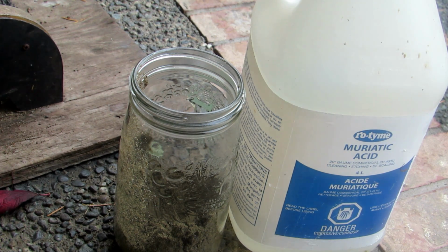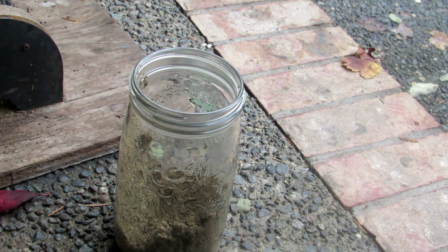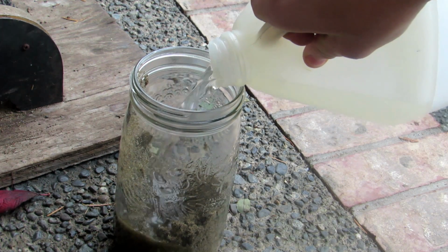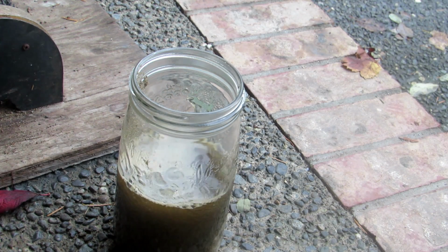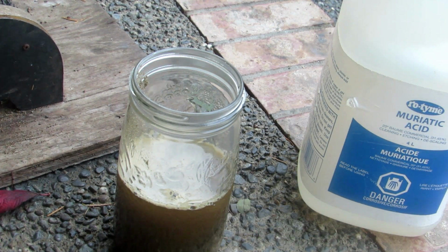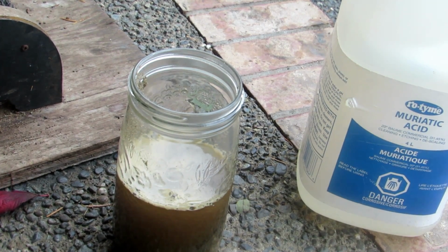So, what we first must do is totally cover this with hydrochloric acid. So, we've got our sand here. Just open up the hydrochloric acid and pour in a copious amount. We are going to want a large excess because we want to get rid of as much of the impurities as possible before we proceed to the next step. So we'll just let this sit for a bit to make sure everything dissolves, and I'll meet you back tomorrow after this has sat for a good day or so.